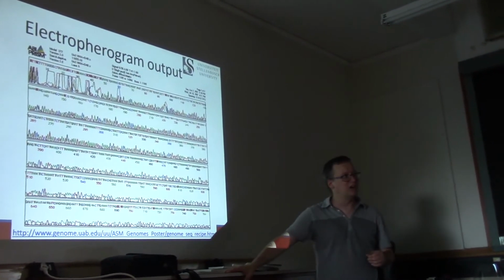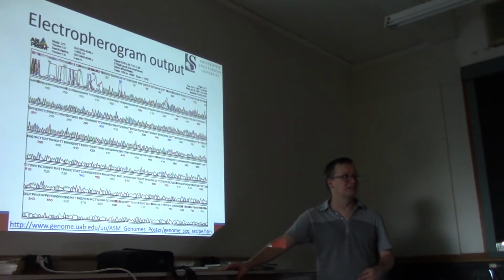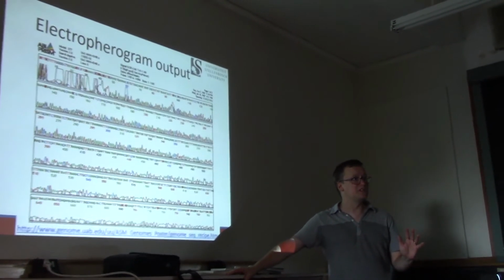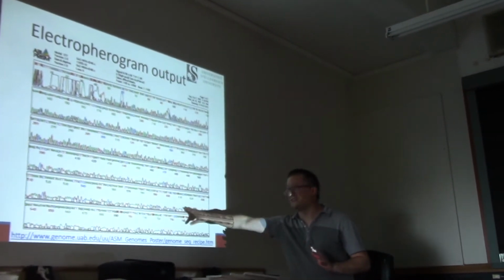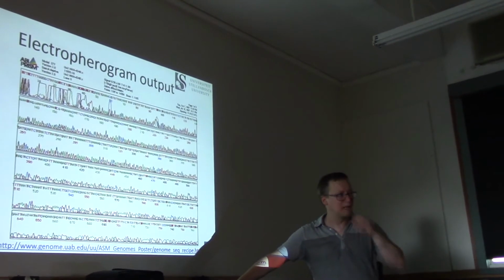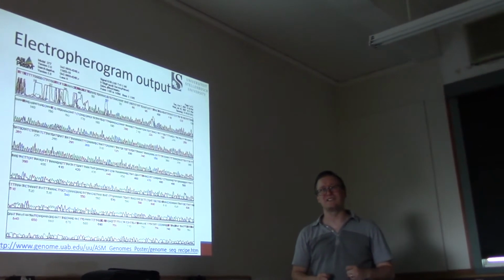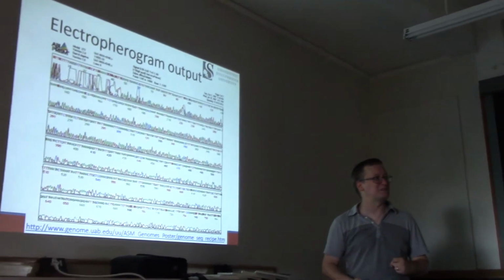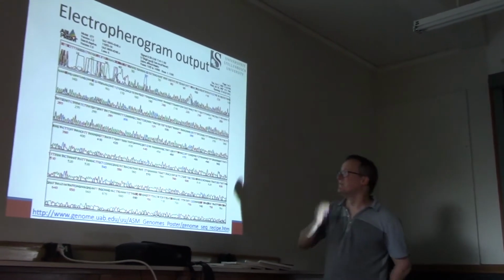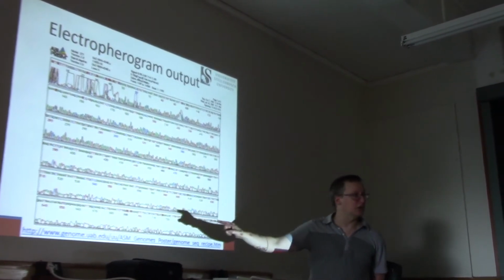Electropherograms in general are not something that we retain when we use a short-read Illumina sequencer. It's way too much bulk for us to do so. So frequently what we'll store is not this electropherogram, but rather the information we derive from it. You have to pick your battles sometimes, right? If you find that storing a 1 gigabyte file for a sequencer is painful, try storing 10 gigabytes per file. It doesn't get better.